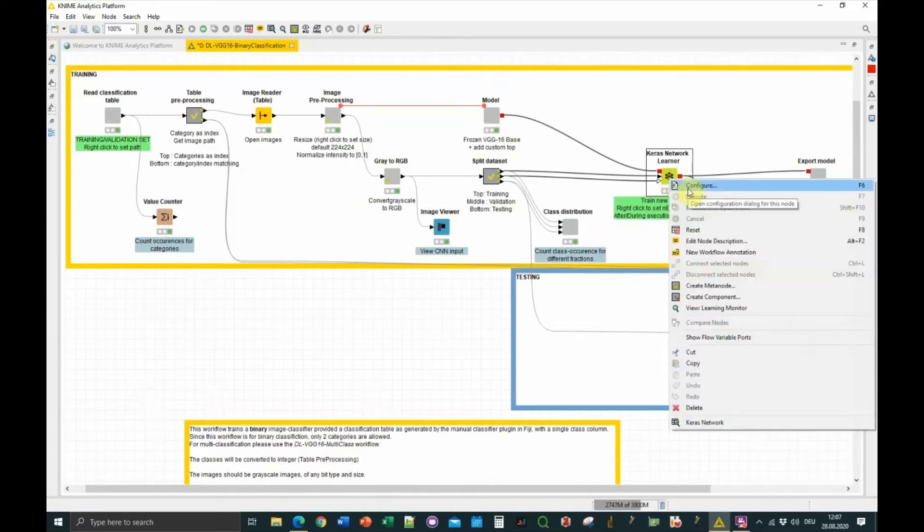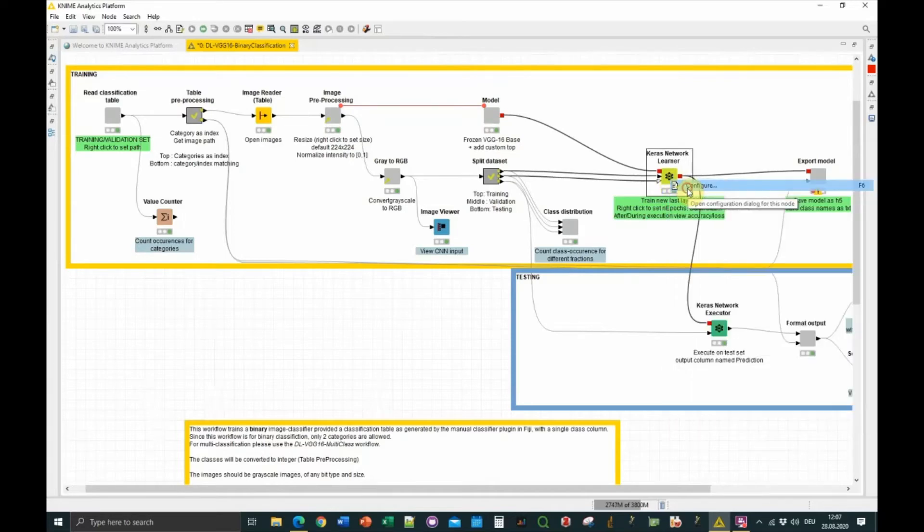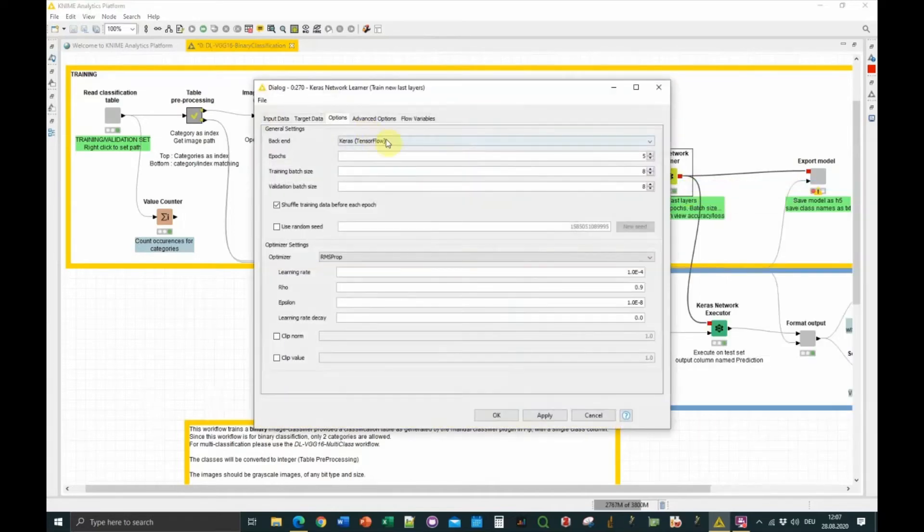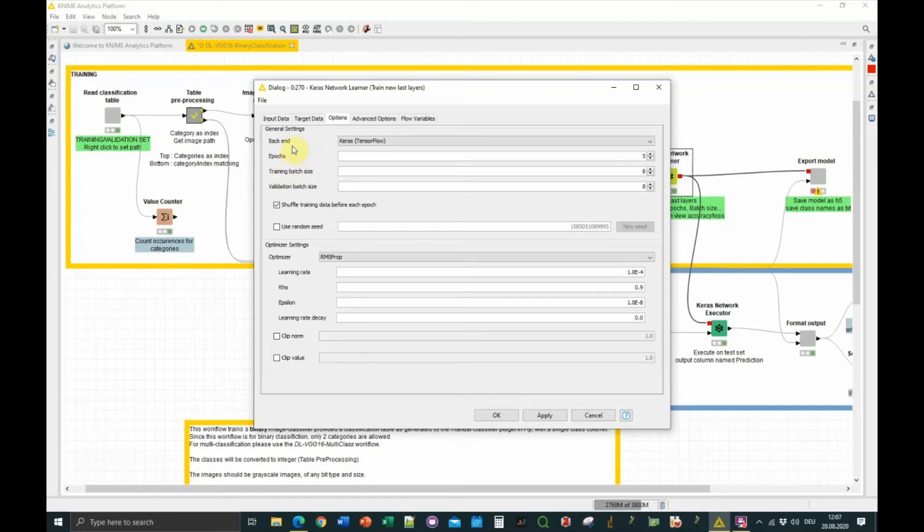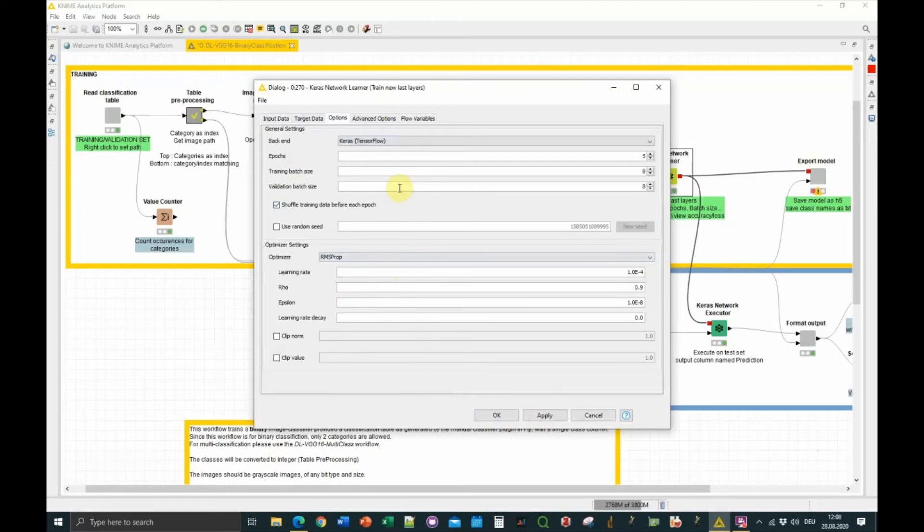Once this model is loaded, it's given to the network learner which is responsible for the training. You can change the parameters of the training in the configure window. The important parameter is epochs, so how many iterations of training you want to do. One epoch is one passage of the full training set through the network. You can also change the learning rates and normalization parameters if you are familiar with these parameters. Otherwise, I would advise to leave them.